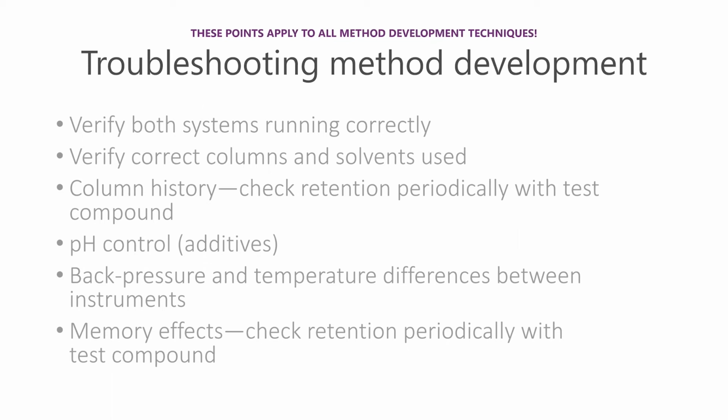Analytical columns are used for more samples than the larger prep columns due to screening, and so may wear out faster. A symptom is that peaks elute consistently later than expected during preparative runs because compounds are retained less on the analytical scouting run, resulting in a calculated gradient that has too little co-solvent. Additives might be needed for good peak shape, although sometimes peak retention might be very different for ionizable compounds when the gradient is adjusted for preparative runs.